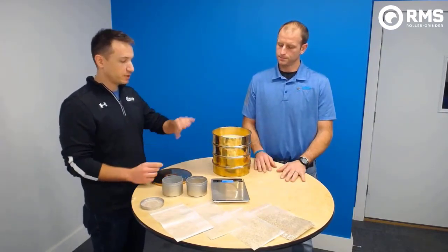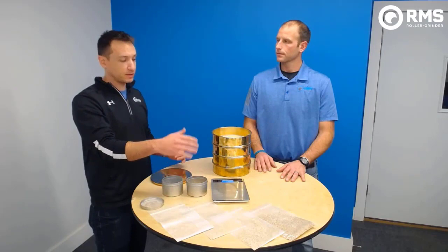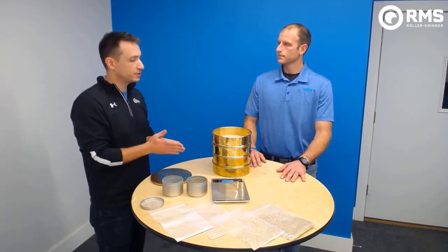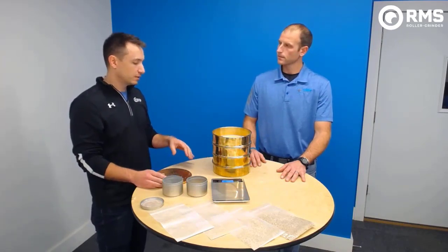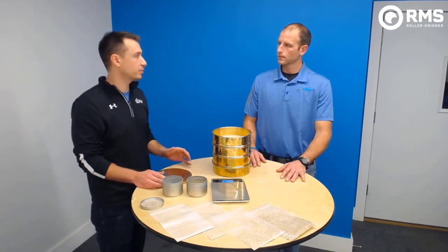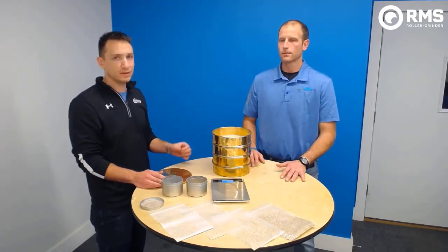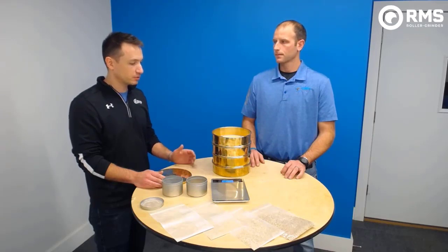Once we have those weights, we know what our distribution is — how much we have in each one of those sieves. With that, we can determine the distribution across our sample. Our key goals and general rule of thumb for targets: for the 14 sieve, we shoot for 50 to 65%. For the 30, we shoot for 20 to 30%. In the 60, we're typically looking for 10 to 20%. And then we want less than 10% to the pan. It will vary depending on your equipment and where you're actually taking the sample from, but those are the general rules of thumb for where we try to focus.